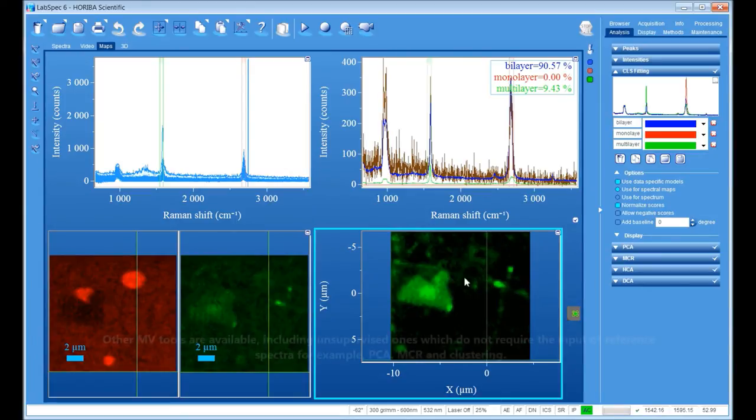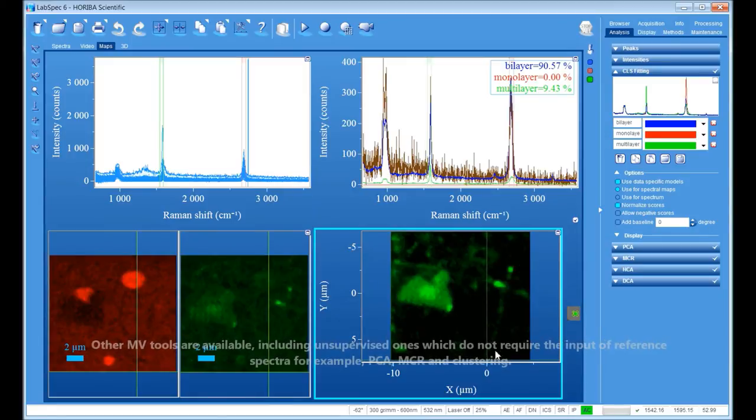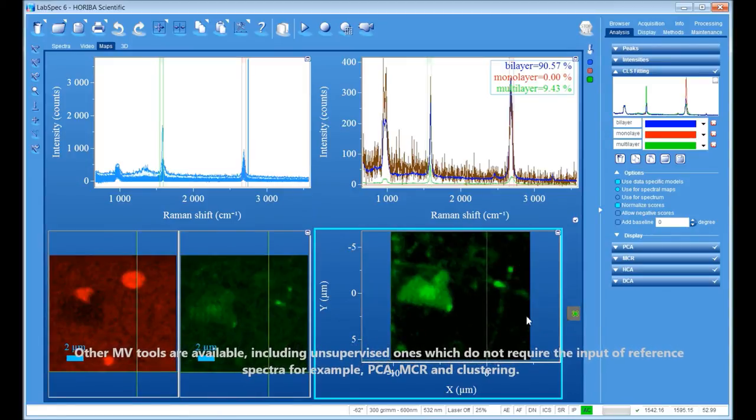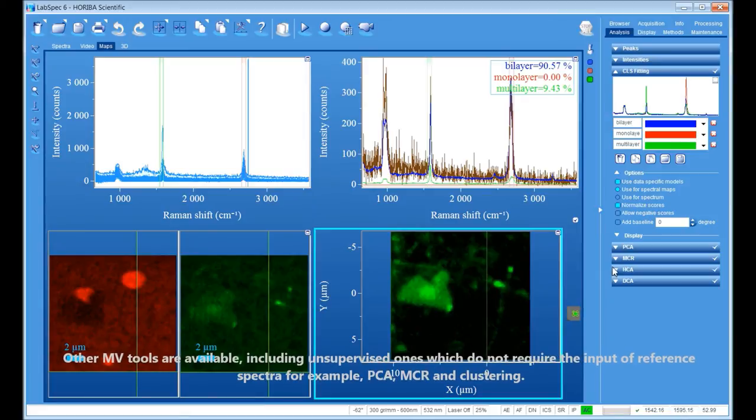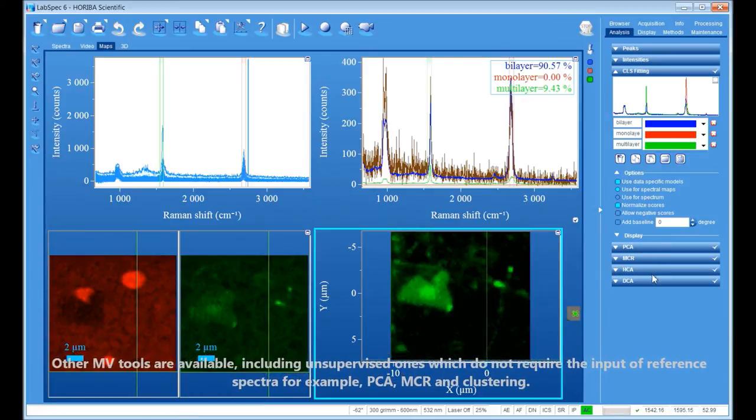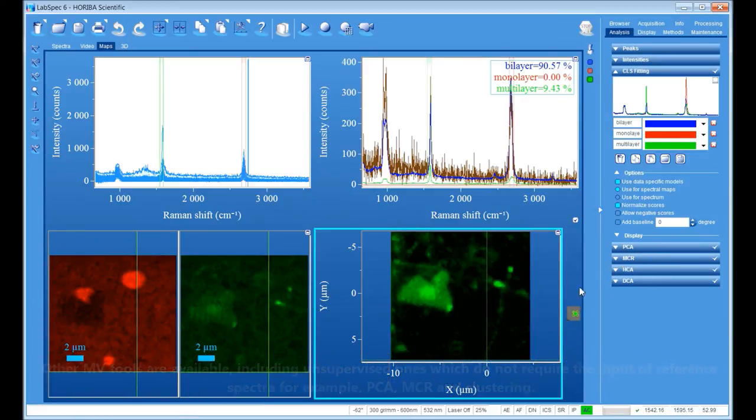Other multivariate tools are available, including unsupervised ones which do not require the input of reference spectra, for example, PCA, MCR, and clustering.